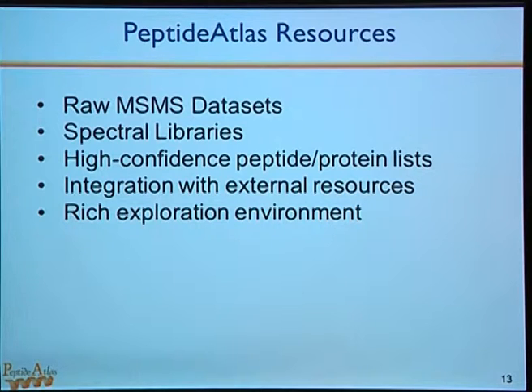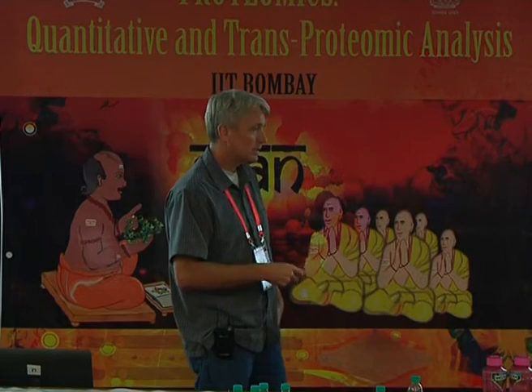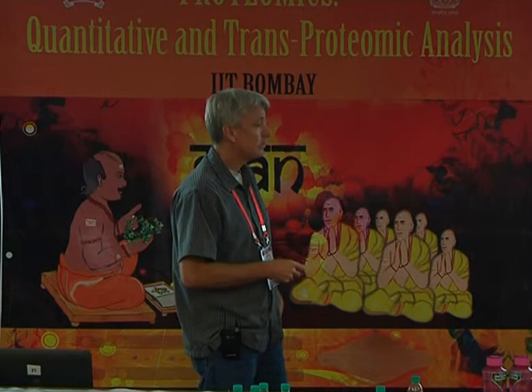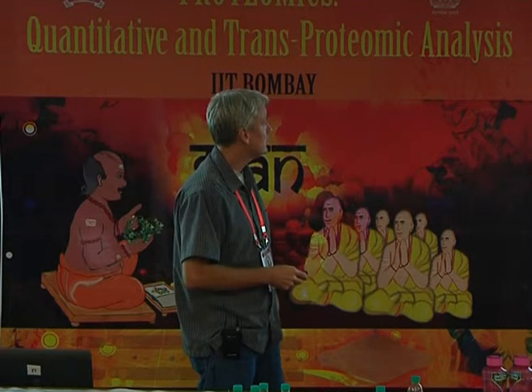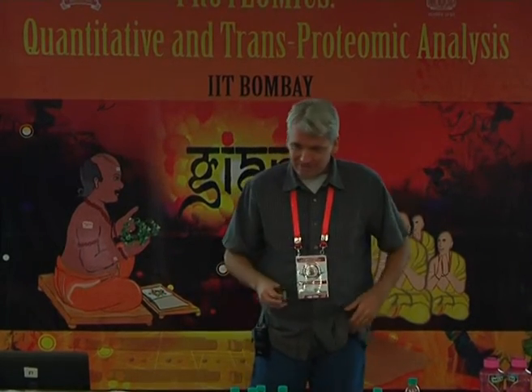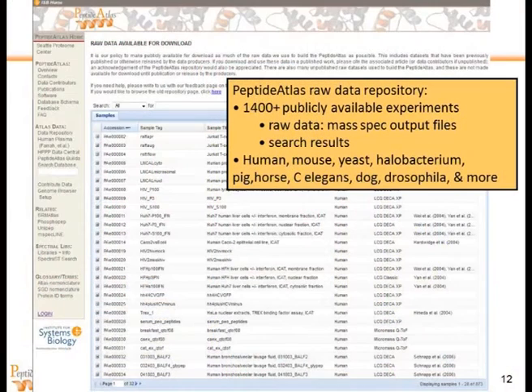And it is a pretty rich exploration environment. It may take some getting used to. I will go through some pages here, and we may do a tutorial where we take you through a few of the interfaces and let you click around. But if anyone is curious, I encourage you to just go and start looking around and see what you find. So the first couple of things I'm going to talk about are essentially large-scale access points to the PeptideAtlas.